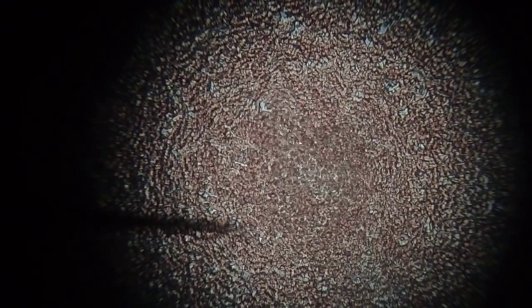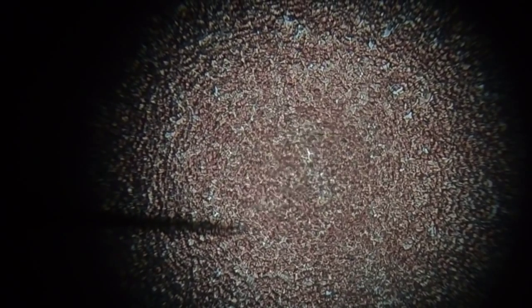All right, this is 200 times magnification of an immature heartworm inside the red blood cells of a dog. On the slide here, there's probably about 50 of these guys running around in this one drop of blood.